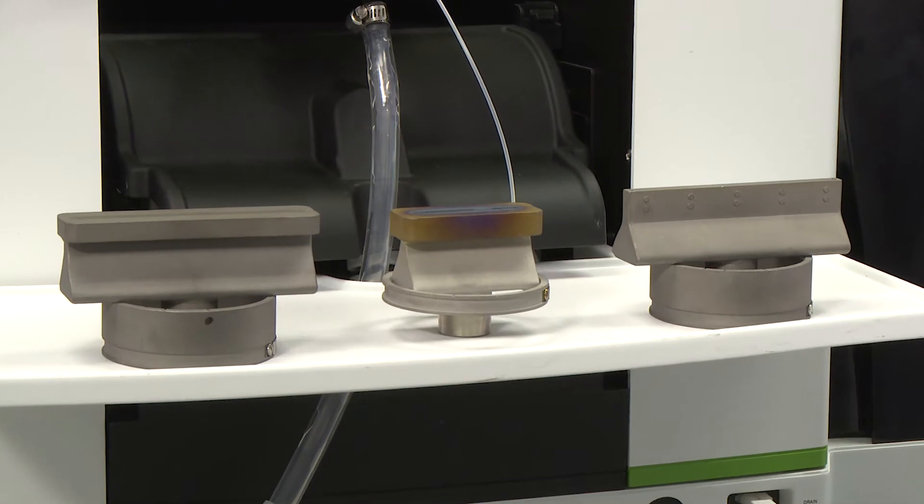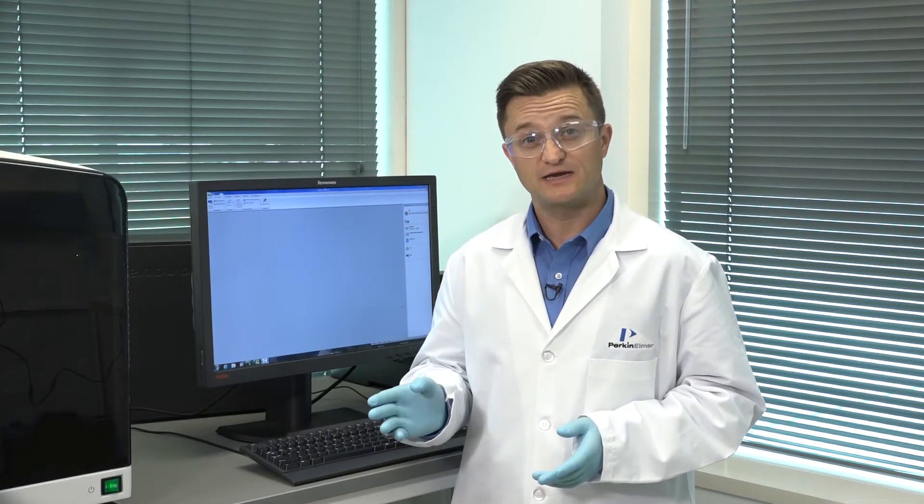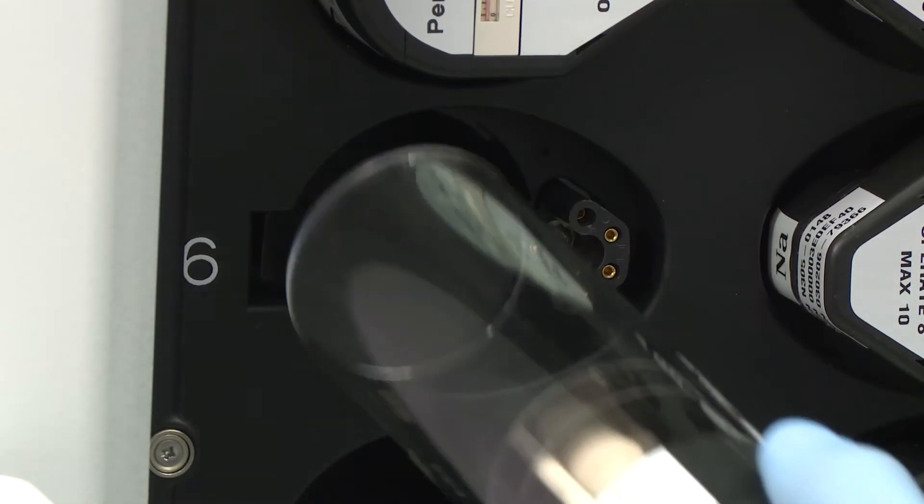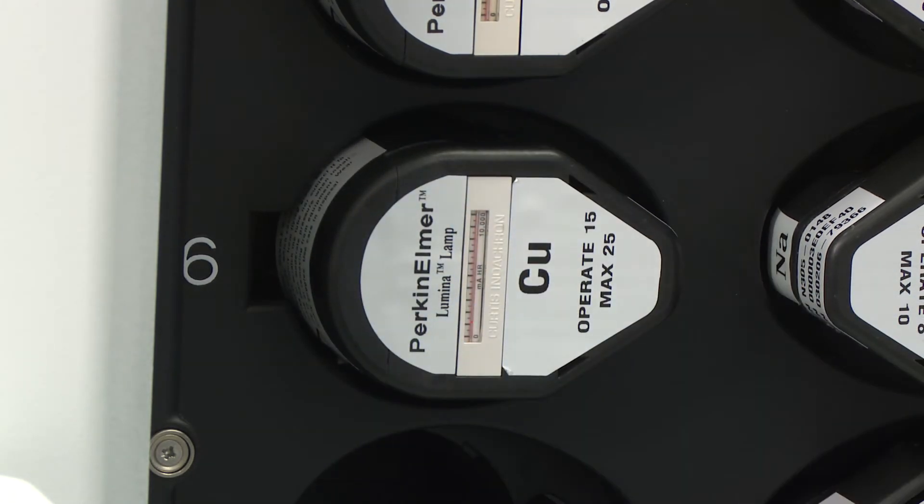First, make sure that the burner system is set up properly and that the correct burner head for your intended analysis is installed. The next step in aligning the burner is to install and align the correct lamp for the element you have selected in the method.